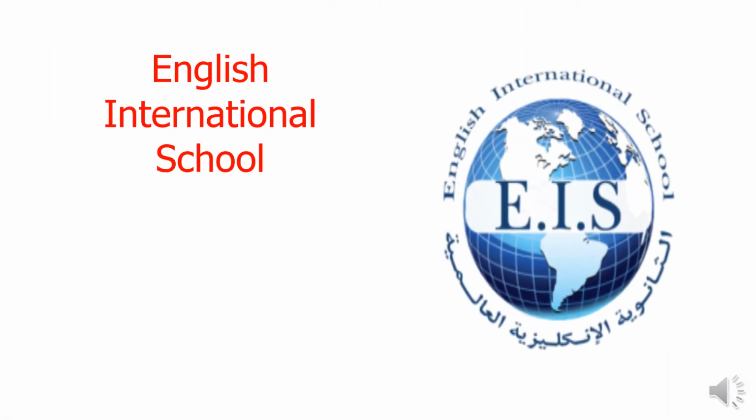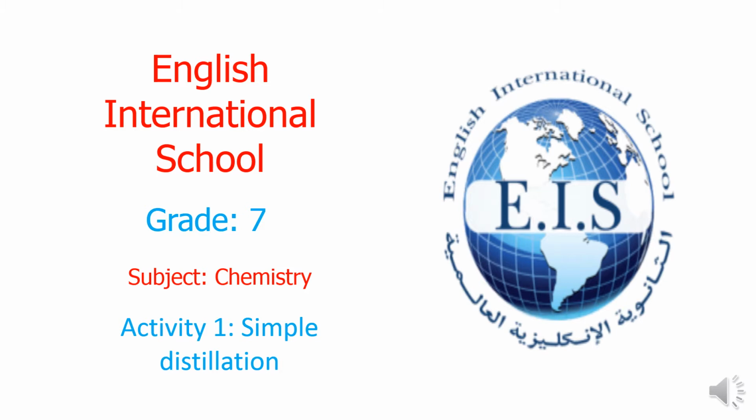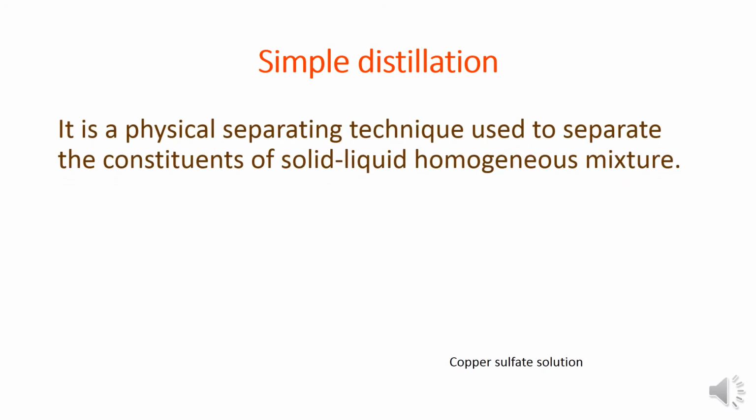Hello, 7th graders. We are going to start a new chapter in chemistry, which is simple distillation. Simple distillation is a physical separating technique used to separate the constituents of a solid-liquid homogeneous mixture.